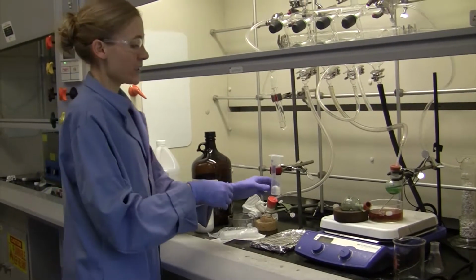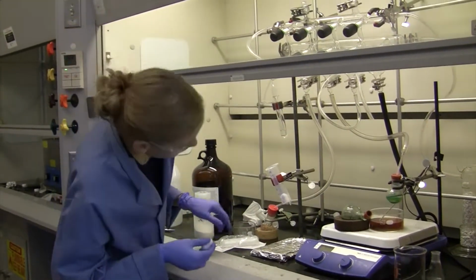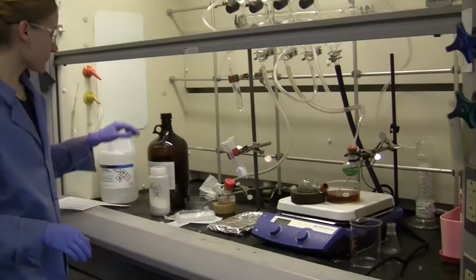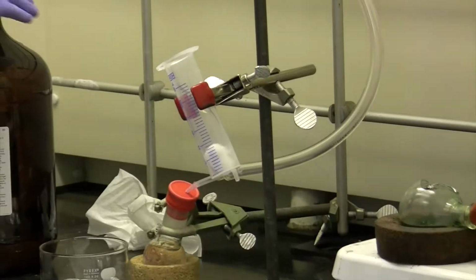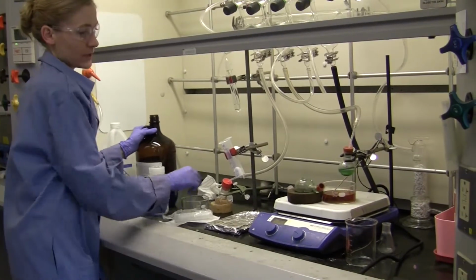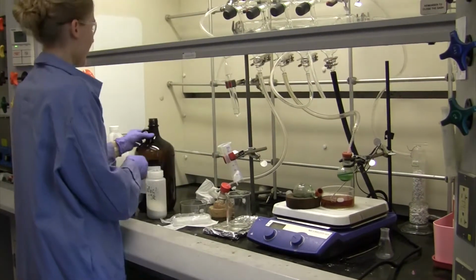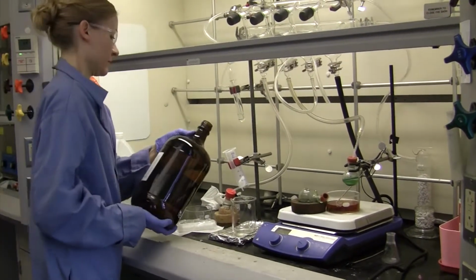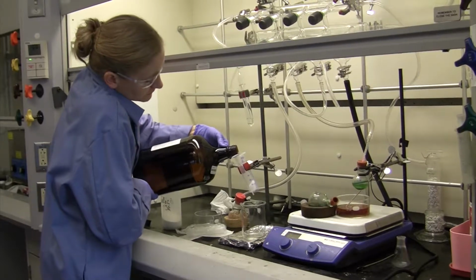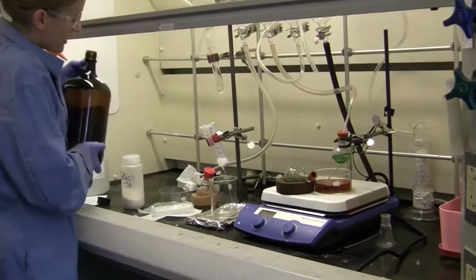And what I have found works really well for this is to wet it. So it's kind of fluffy like that. It's hit or miss whether or not it is going to move. So we will make sure that it's wet.